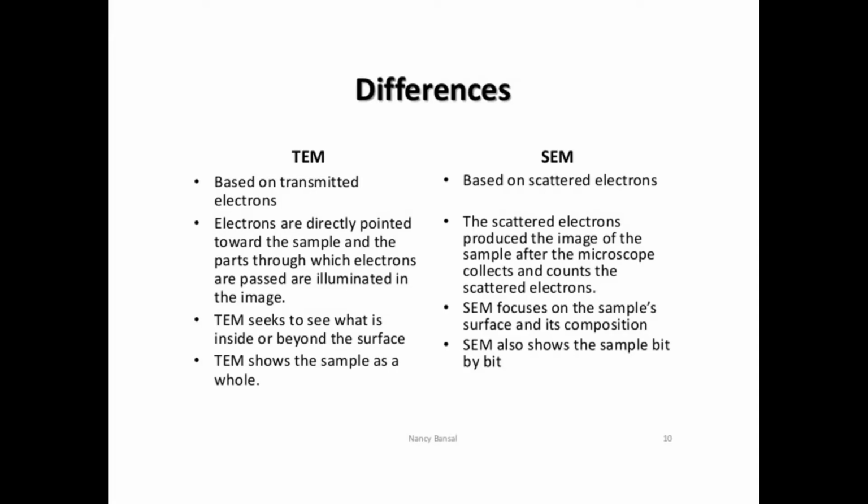That's why higher fees are charged for TEM samples. Normally 7,000 is the nominal charge, and 10,000 to 12,000 is also collected for TEM. For metallic material it's very difficult. SEM is not like that. Within 1000 rupees you can finish one sample along with EDX also, which means elemental analysis can also be done using the SEM.